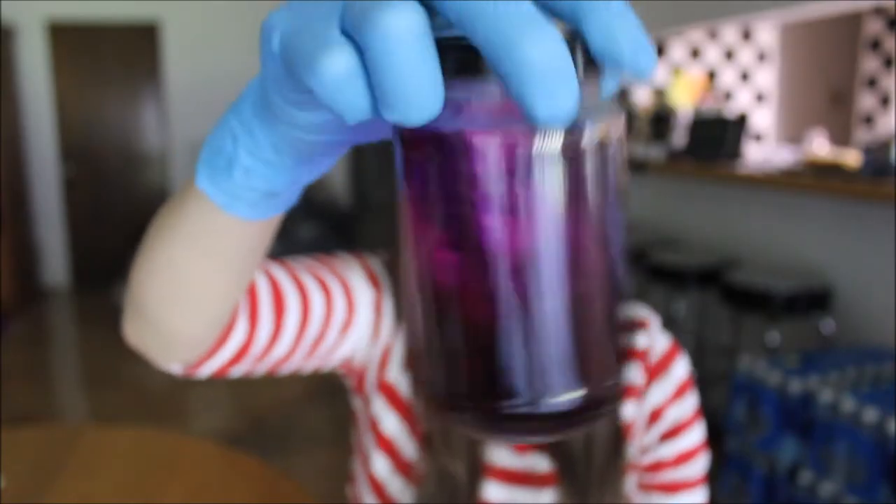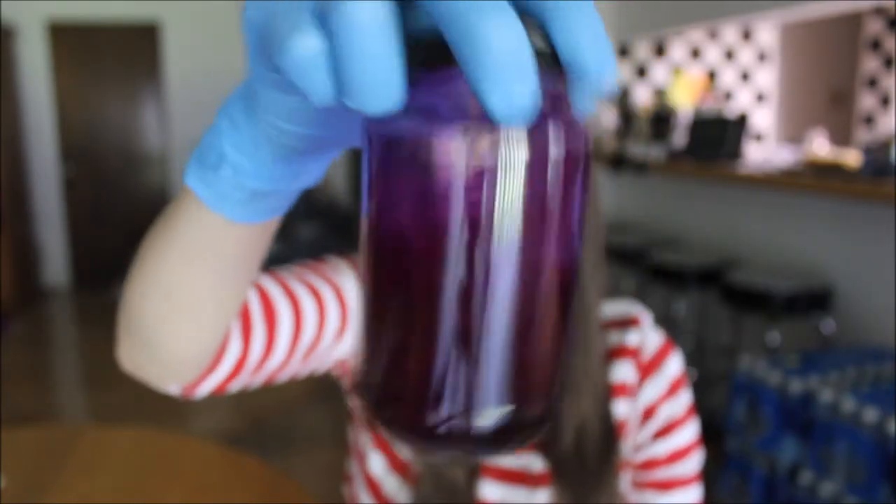So I've mixed my alizarin red solution, and it's turned purple, as you can see. So now I'm going to be transferring my specimen, the bird, from the trypsin digestion solution into the alizarin red bone stain.